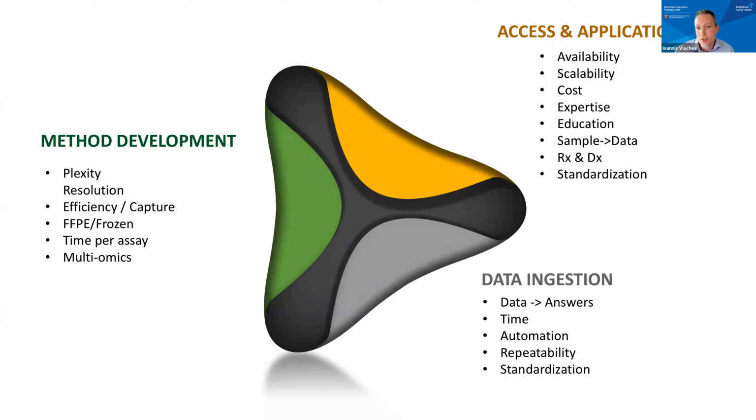And it's not just purchasing an instrument or setting up an assay. It's scalability, access to expertise, training, education from junior to senior scientists, but also stakeholders, opinion makers, time and processes from sample to data. It cannot be months. It's a big issue. Then there are research grade and clinical grade applications. What do we need to make it into the diagnostics world? What do we need to do to get CLIA certified? What are the next steps?